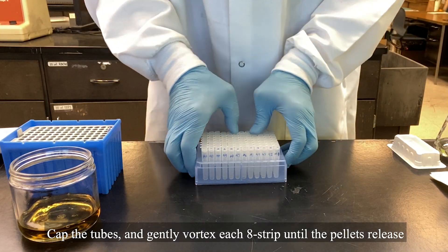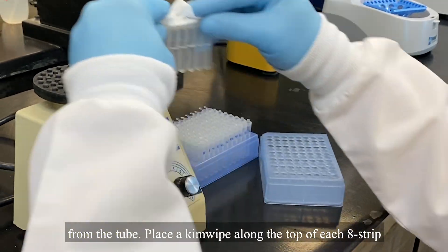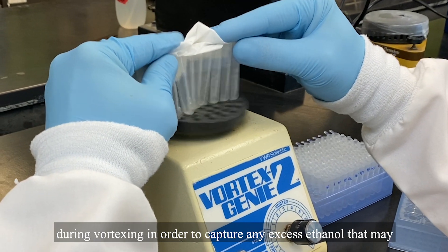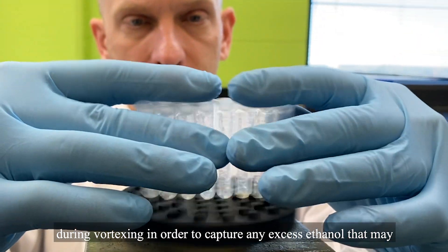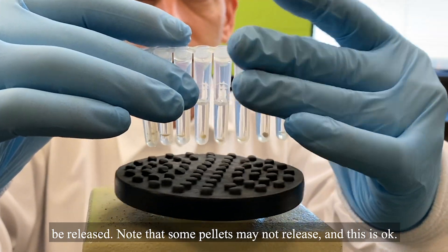Cap the tubes and gently vortex each H strip until the pellets release from the tube. Place a chem wipe along the top of each H strip during vortexing in order to capture any excess ethanol that may be released. Note that some pellets may not release and this is okay.